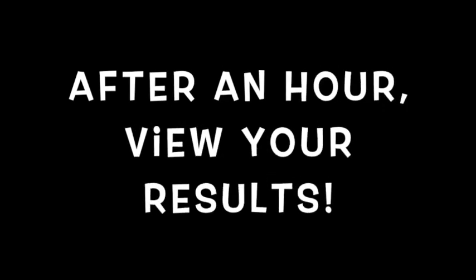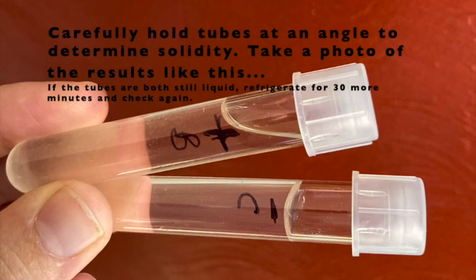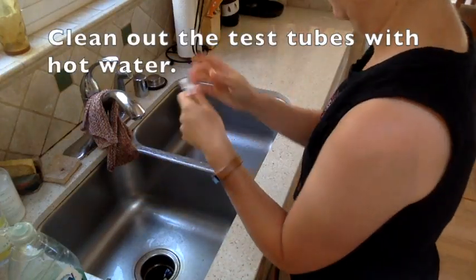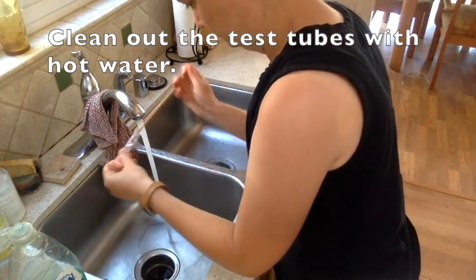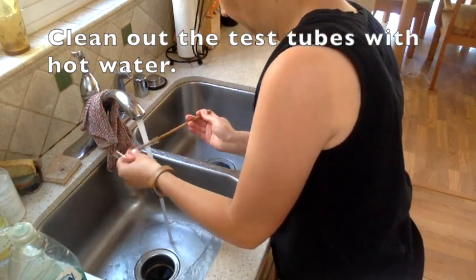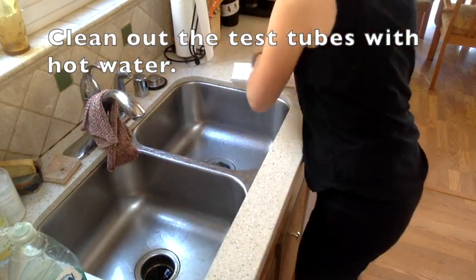After an hour, view your results. You're looking for whether or not the gelatin solidified. Hold the tubes at an angle to determine whether or not the solution is solid, and take a photo of the results. If the tubes are both still liquid, refrigerate for 30 more minutes and check again. Then clean out your test tubes with hot water — it may be hard to get solidified gelatin out of the minus C tube, so use something like a chopstick to help. Wash them well in the sink or put them in the dishwasher. Make sure you complete the analysis on Canvas.